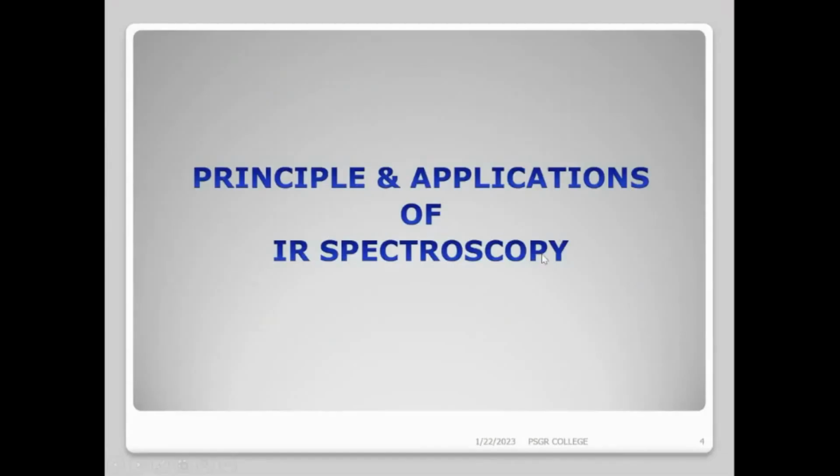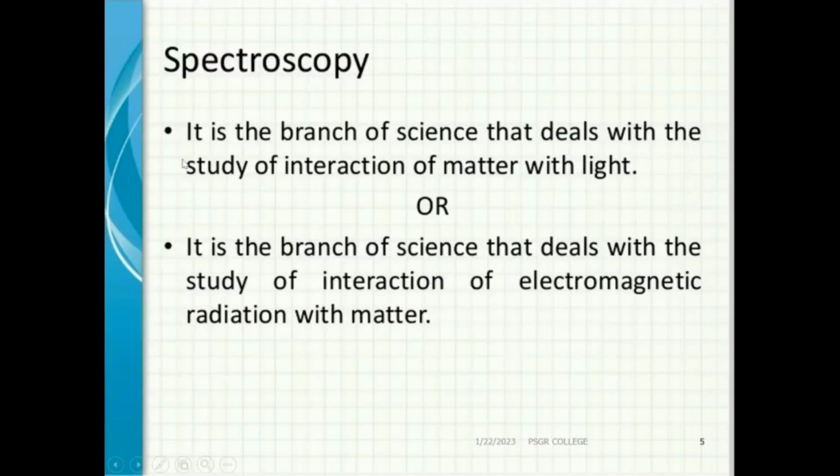Today I'm going to discuss the principles and applications of IR spectroscopy. Spectroscopy, as I told, is an interaction of radiation with matter. That is very important: the radiation should interact with the matter. So in IR spectroscopy, we are going to interact IR radiation with matter.